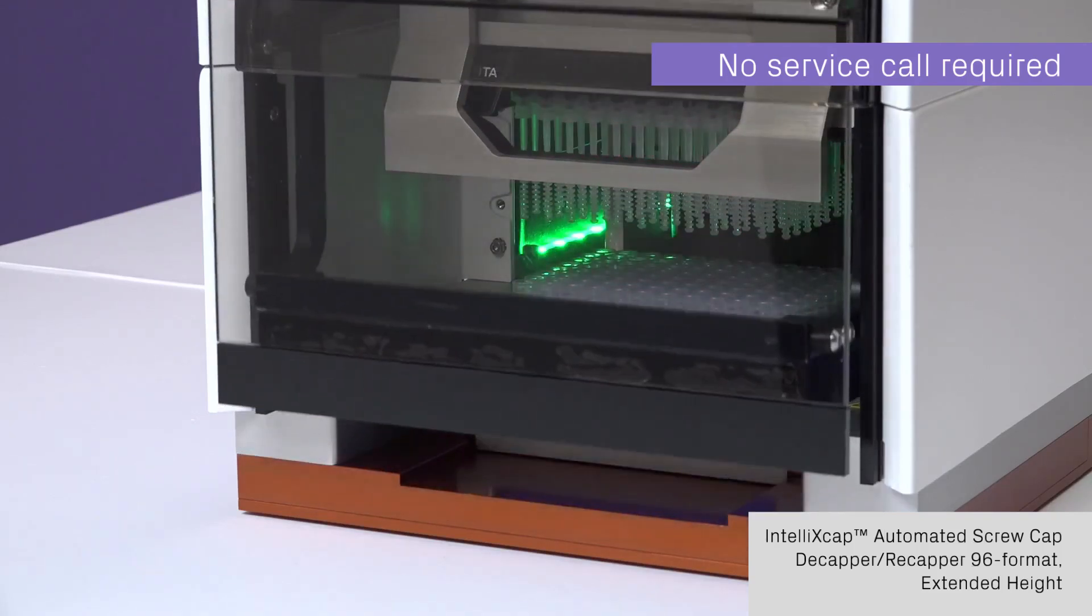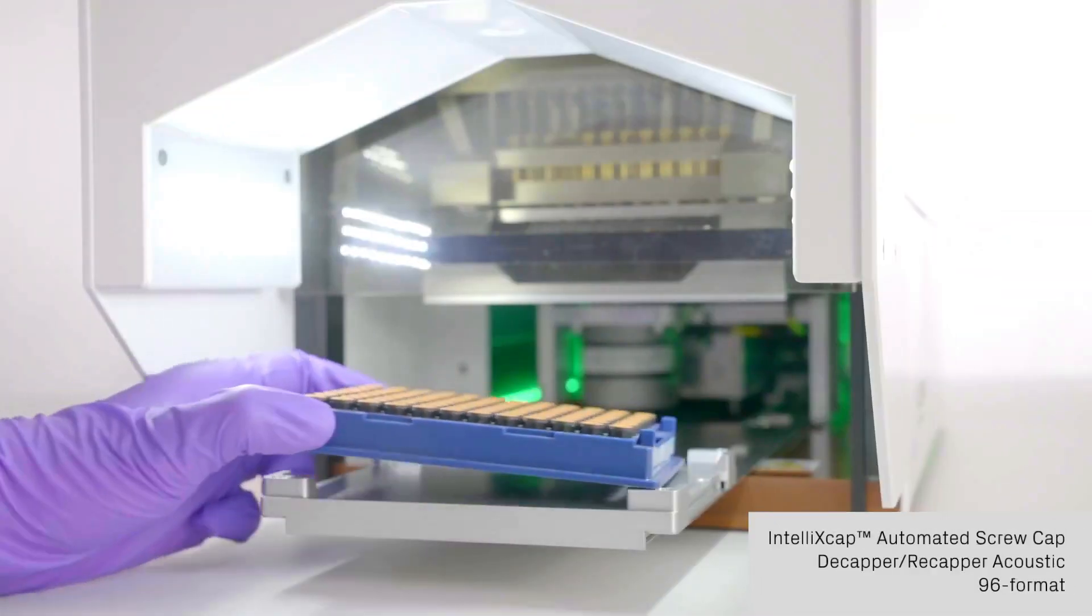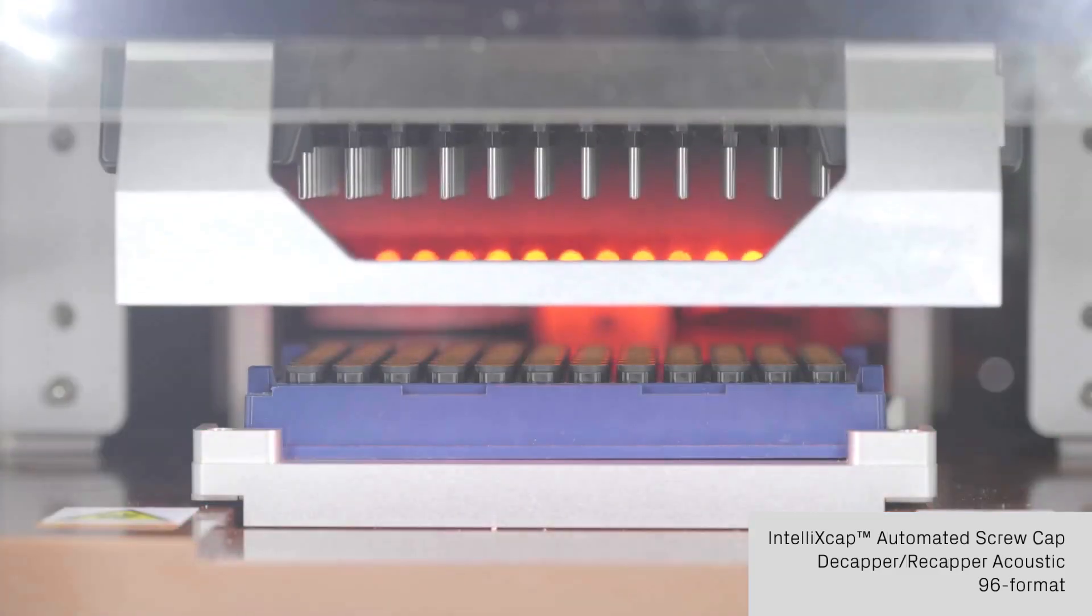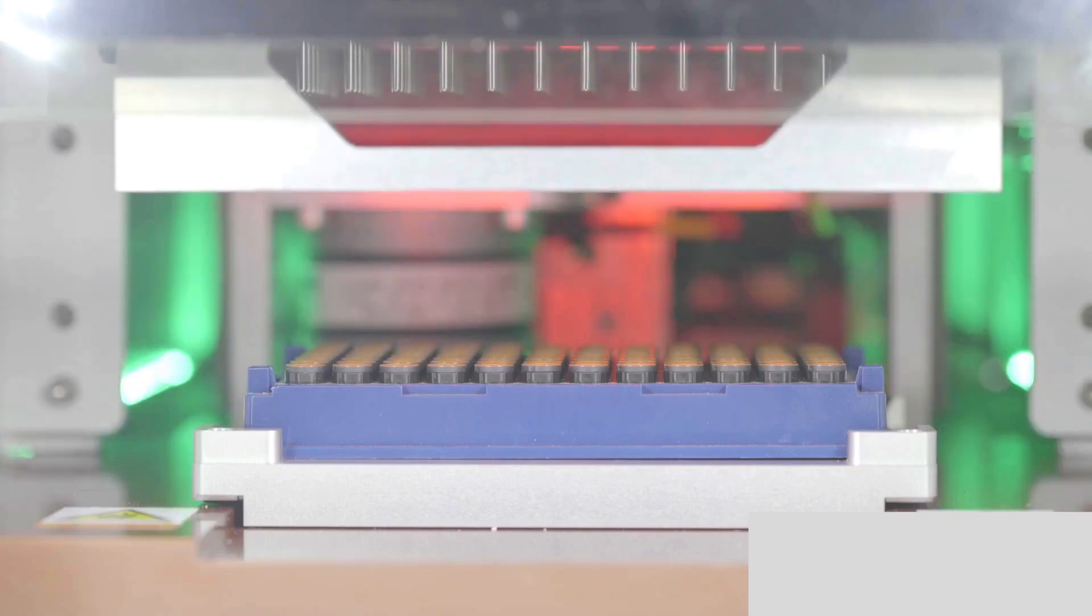With auto capper-decapper units to suit most budgets and workflows, there's bound to be an Azenta decapper to suit your needs. Ask for an in-lab demonstration now and find out how much time and effort you could save.